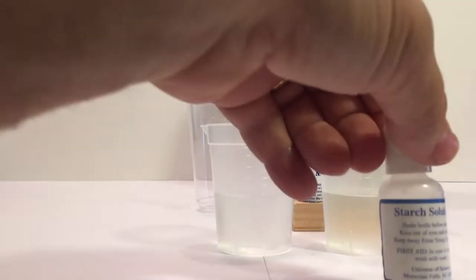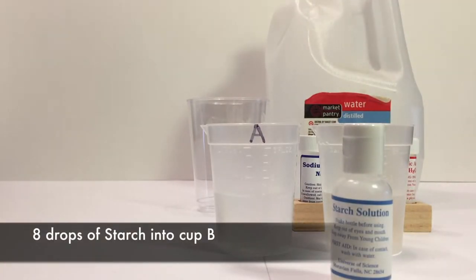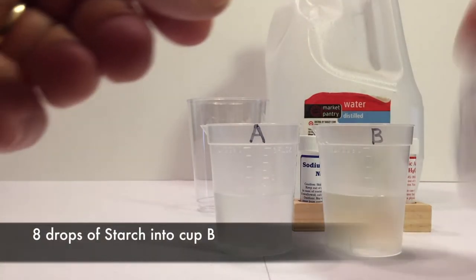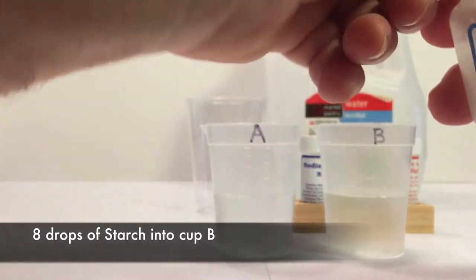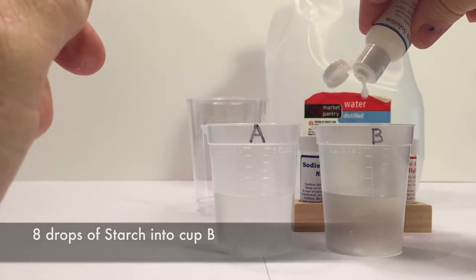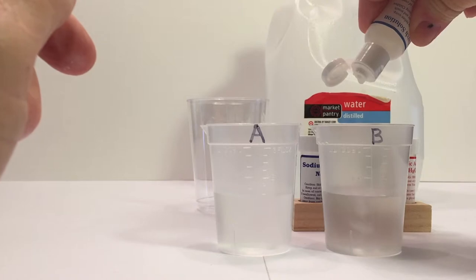Then we're going to take our liquid starch. It comes with the kit. You're going to give that a really good shake. You want to shake it up very well. And then you're going to put eight drops into cup B.